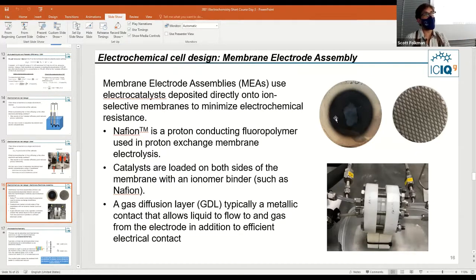So it's a kind of specific question. So let's say that you have a Faradaic efficiency that is way over 100%. And you're rather sure that you account for all the liquid or gas products. So how do you proceed to understand if maybe your catalyst is reducing or the process, something like, is there a protocol to do? Yes. It's complex, I know, but I'm really curious.